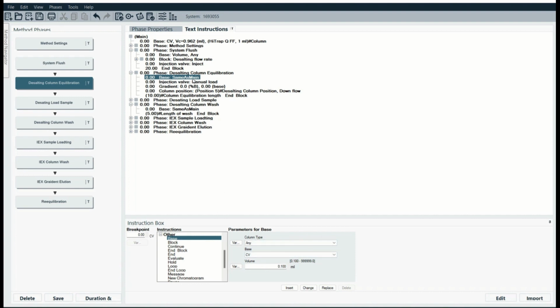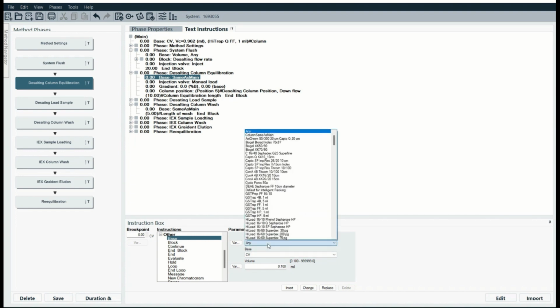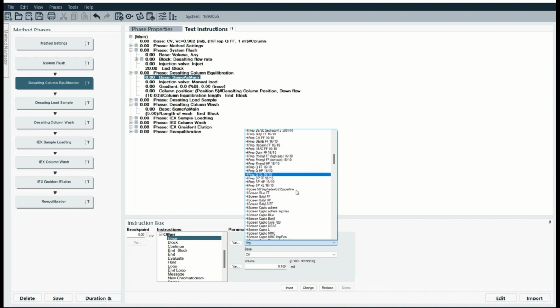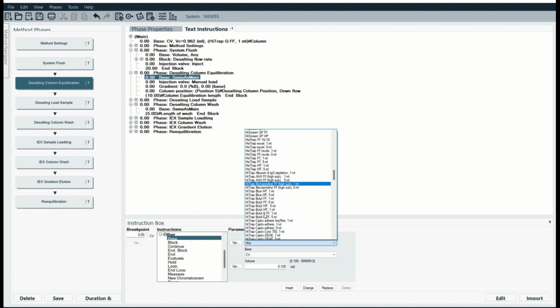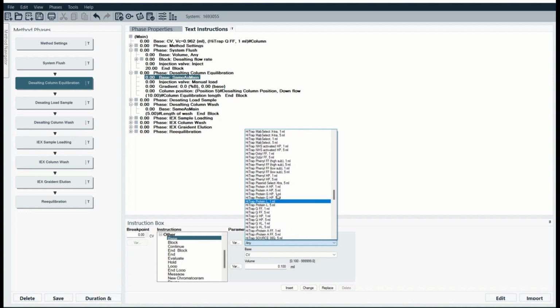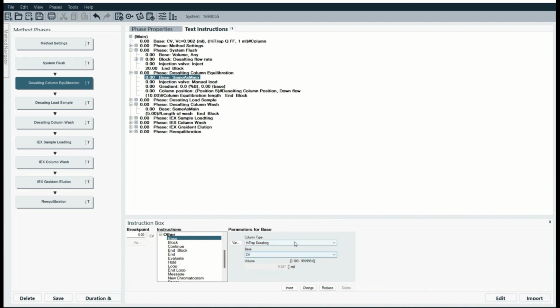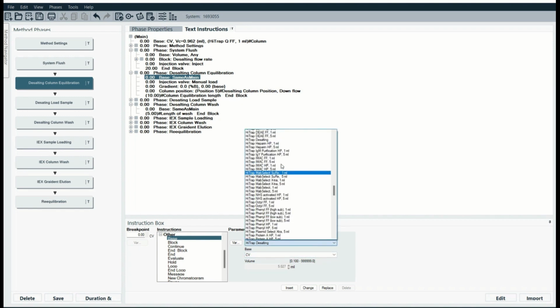So we're not doing SameAsMain, we're doing CVs, but we're not doing the same HiTrap Q column up here. So we're going to do the HiTrap desalting column. This is where I was saying I can't remember if it was here my first try, but I said it was going to get a little screwy with the columns. Whoops. I just said desalting. I want desalting.